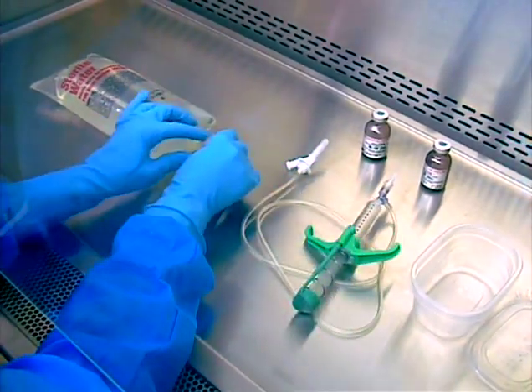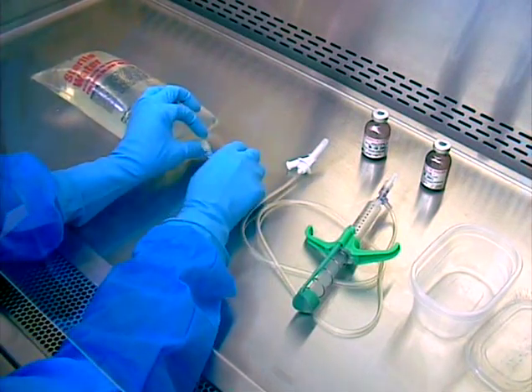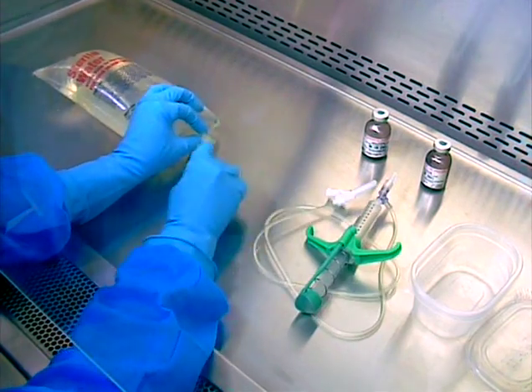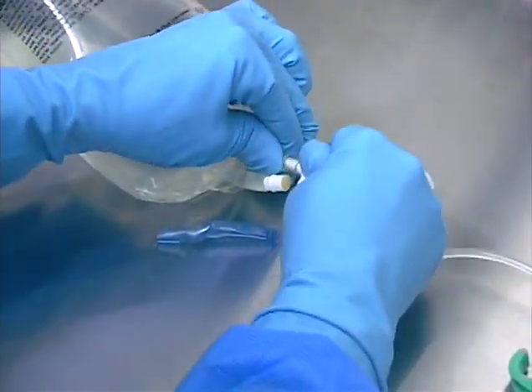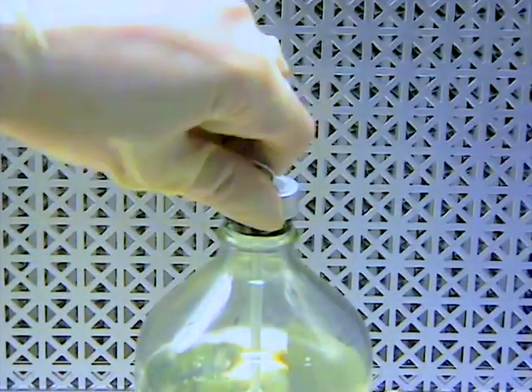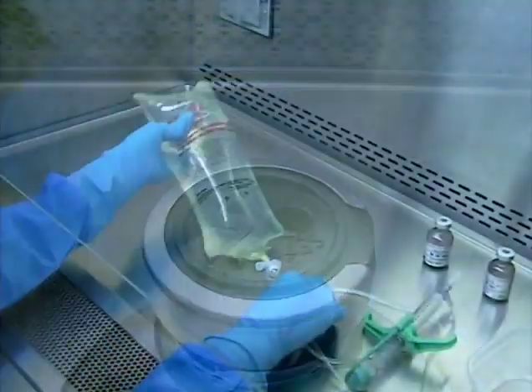If using a bag for the source solution, orient the administration port in first air and remove its plastic cover, using care not to contaminate the sterile pathway. Remove the cap from the spike end of the tubing attached to the syringe and insert it into the administration port, puncturing the inner seal. If a bottle is to be used, remove the metal cover and rubber seal. Hang the bag or bottle.